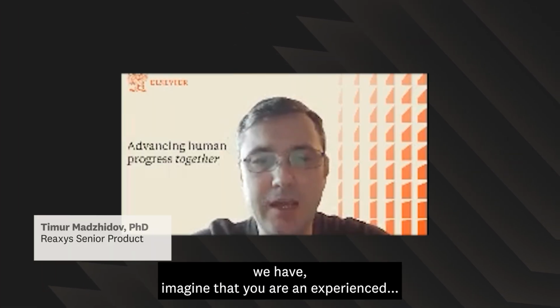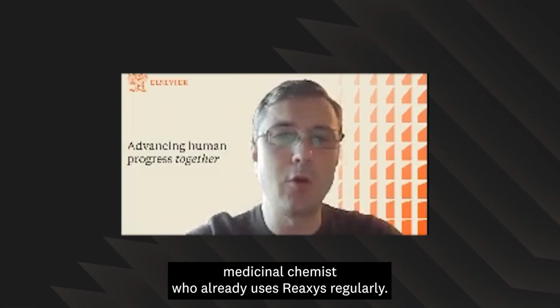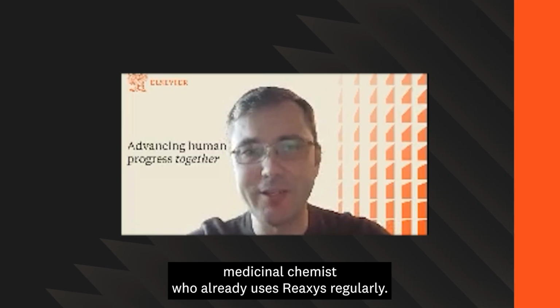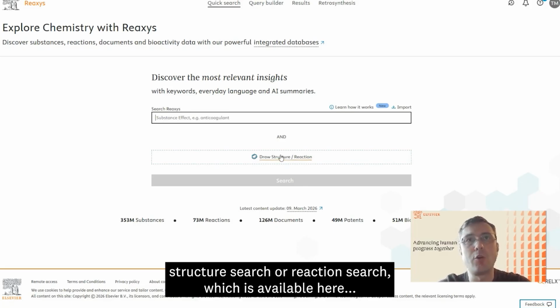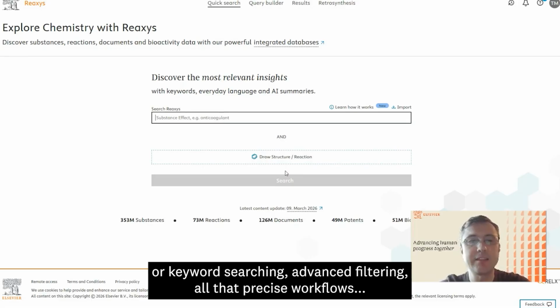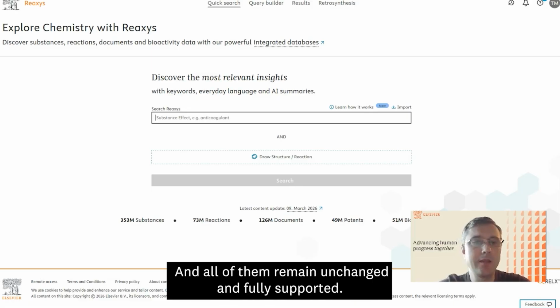In this case, imagine that you are an experienced medicinal chemist who already uses Reaxys regularly. This is someone who already relies on structure search or reaction search, which is available here, or keyword searching, advanced filtering, all those precise workflows that Reaxys provides. And all of them remain unchanged and fully supported.